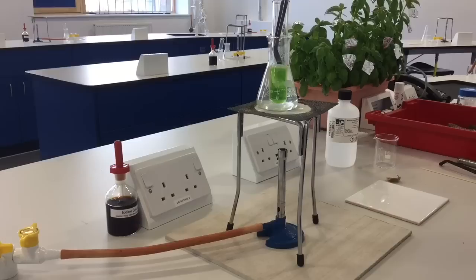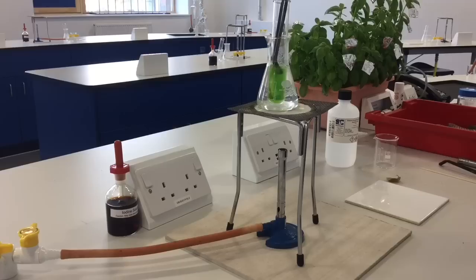About now our leaf should be well and truly decolorized. I've switched the Bunsen burner off—you don't need it anymore. It still boils without the Bunsen burner; the heat of the water is still above that 78 degrees needed to boil the ethanol.